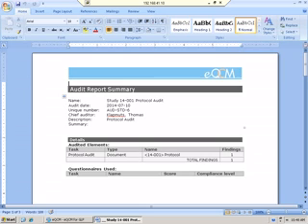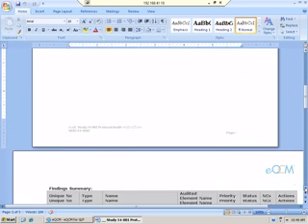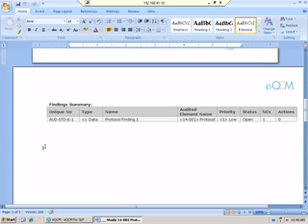So here we're mapping the audit name, the audit date, the audit number, the chief auditor, any description, and then a summary. It has all of the audited elements. So in this case, I did a protocol audit. It was a document, the name of the document, and then if there were any findings associated with it. If there were any questionnaires used for the audit, they would be shown here with the information, the score, and the compliance level. The second page has all of the findings.